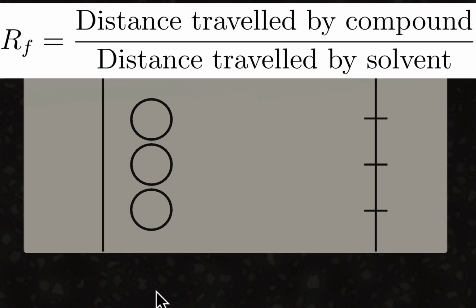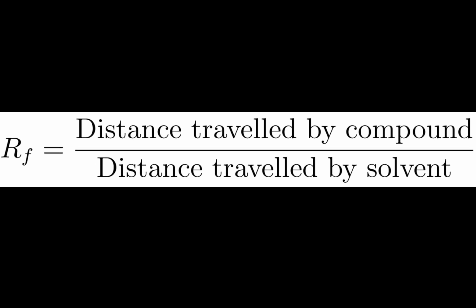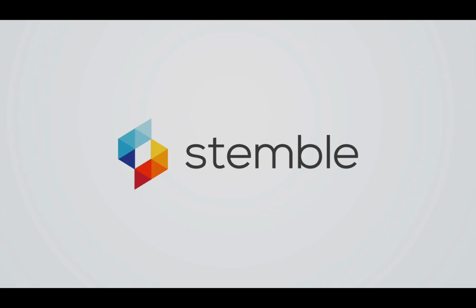Because these are ratios of distance, it really doesn't matter what tool you use. You could literally measure them off your computer screen if you like. And that concludes the simulation.